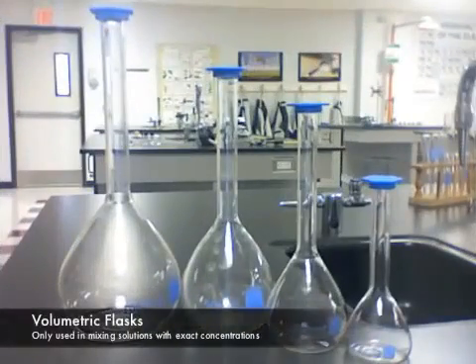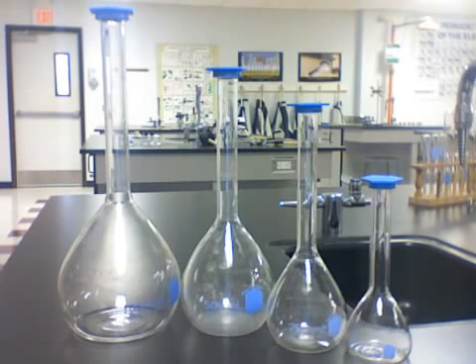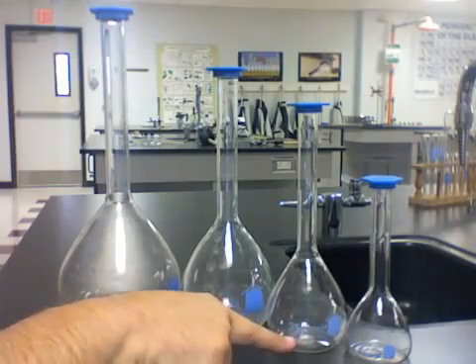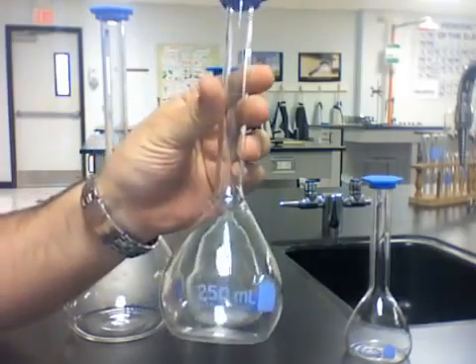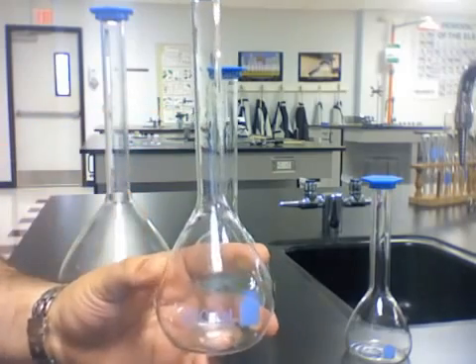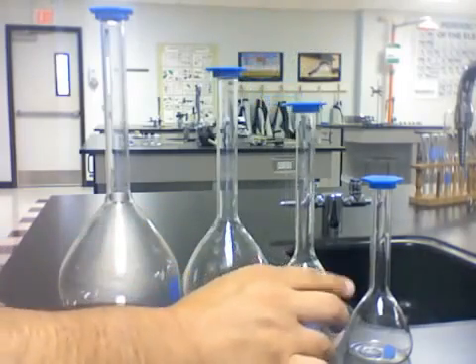Okay, here we have volumetric flasks. These are used to make solutions. We don't use them to measure in. We don't use them to heat things in. All we do is use them to make solutions. They only have one gradation, one line on them, and for example this one says a 250 milliliter volumetric flask. We would use this one to make exactly 250 milliliters of a solution by measuring out the right amount of a solid in there and then dissolving it in water and adding the water up to that line, and it would make exactly the concentration of solution that you want. Again, these are volumetric flasks.